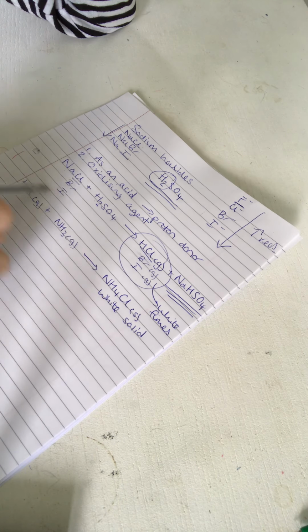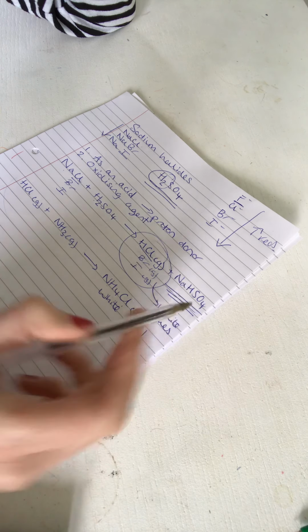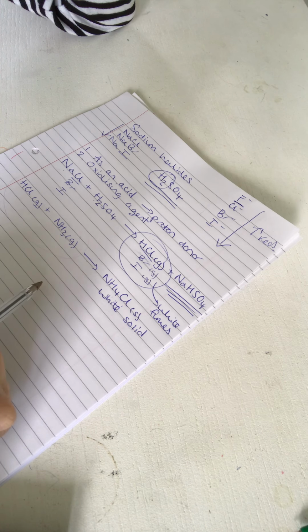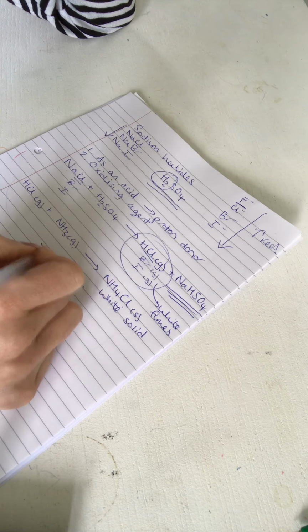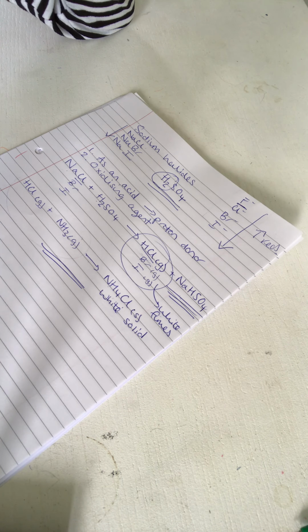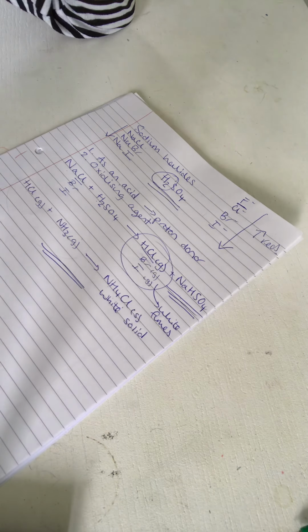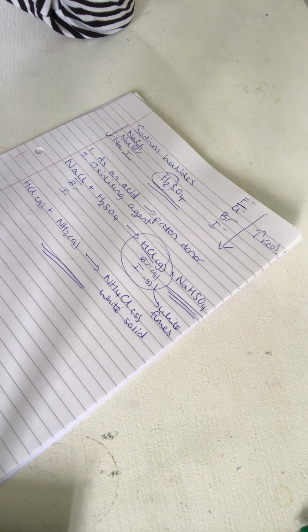It will react with ammonia to give you the ammonium salt, NH4Cl or NH4Br or NH4I, and that is a white solid. Now, in the case of sodium chloride, that is where the reaction stops. Okay, it won't react any further, and so if all you observe is a white solid and some white fumes and nothing else, then you know the particular sodium halide you had was sodium chloride.